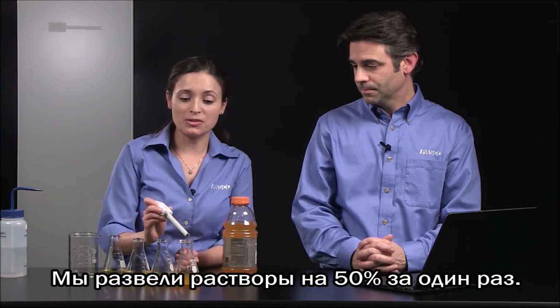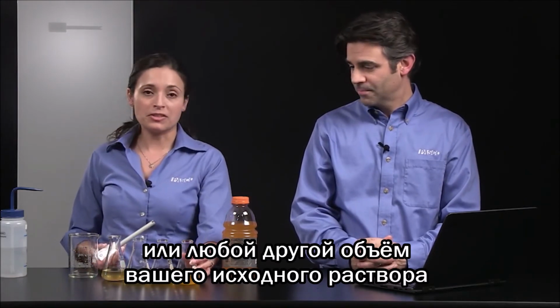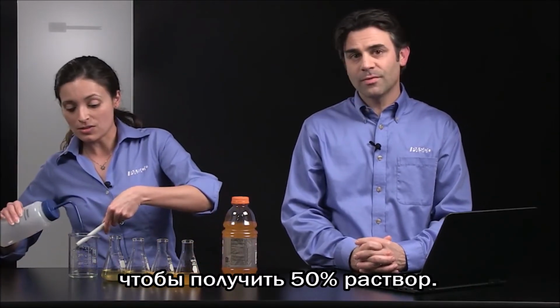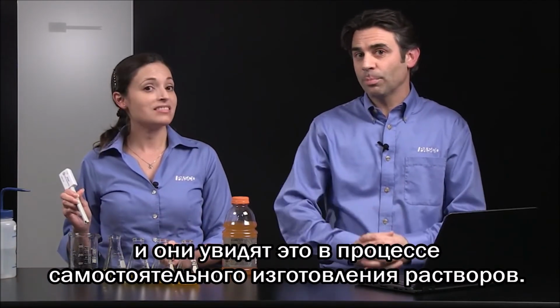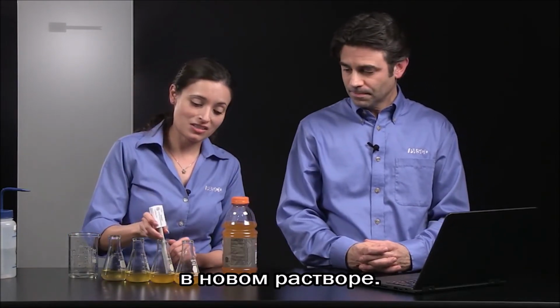We prepared these dilutions 50% at a time. So we took 50 milliliters or whatever volume of your initial solution, and we added 50 milliliters of distilled water to get a 50%. Right, so this is very easy for students to understand right off the bat. They can understand those percentages very easily as we do this dilution, and they can see it as they're making them. Yeah, they can see the orange is a little bit lighter each time in each solution.